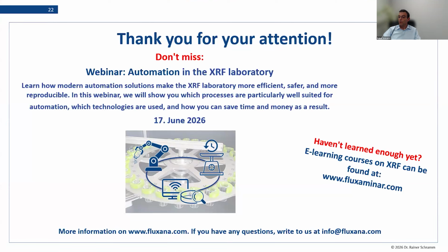Okay. There is another question. Should I treat negative LOI? So this means gain on ignition. Yeah, that means your sample gets heavier during the fusion. Some samples give us negative loss on ignition. That is correct, of course.